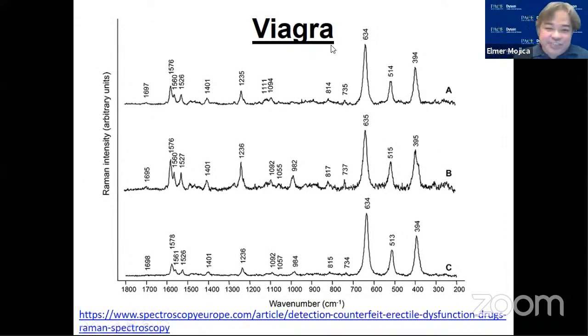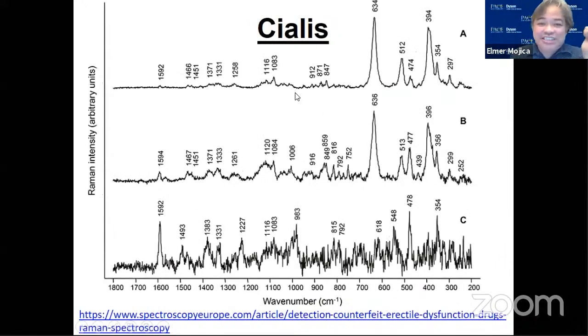So this is the original one, and this is the fake one. So look at the fake one. There are some additional peaks that you don't see in the original one. And then we also use the Cialis here, so you could see the counterfeit, okay? They have additional peaks compared to the original one.